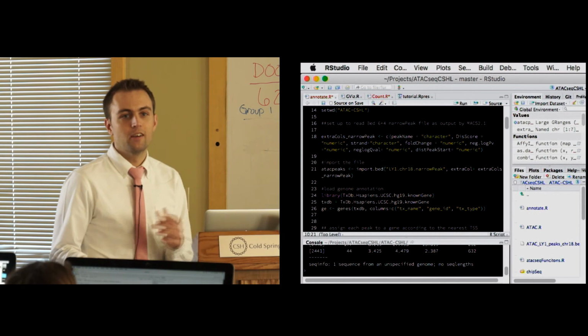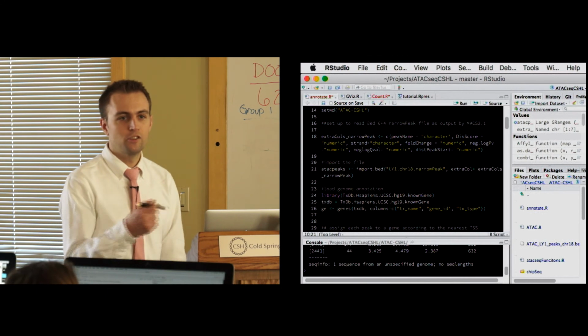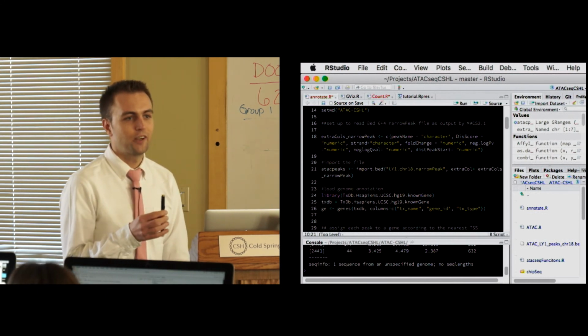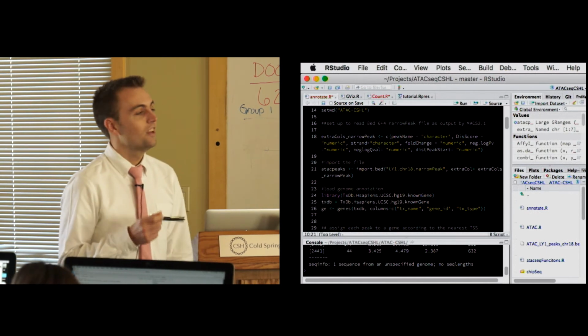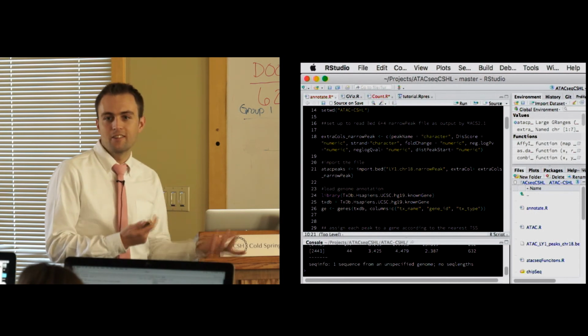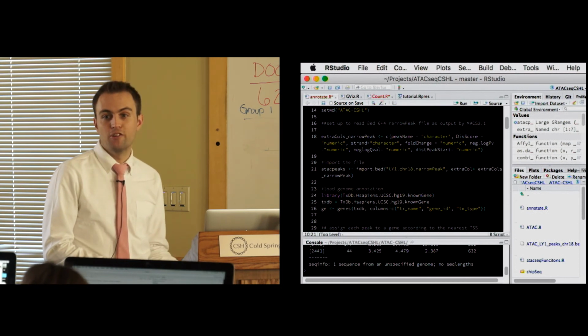It's usually called 2.5 kb. Is it just in back, or in either direction? I always forget that. But anyway, it's right in front of the gene. So there we'll be pretty sure that that area of open chromatin is probably associated with something to do with that gene.